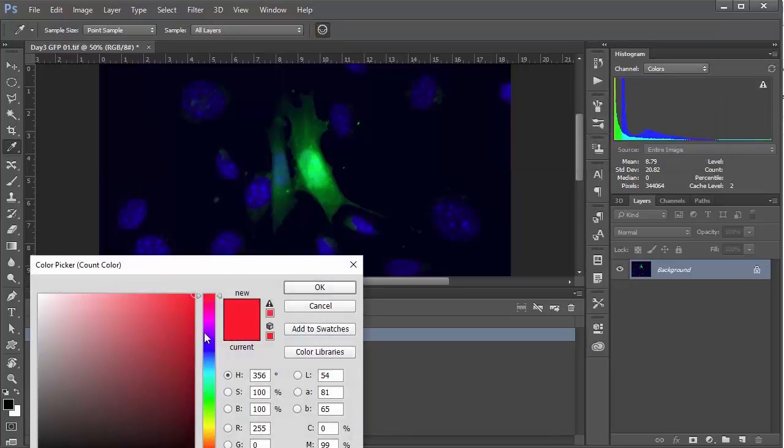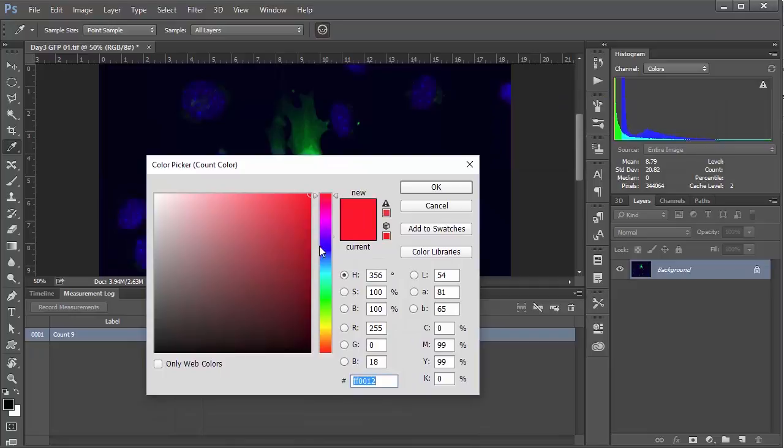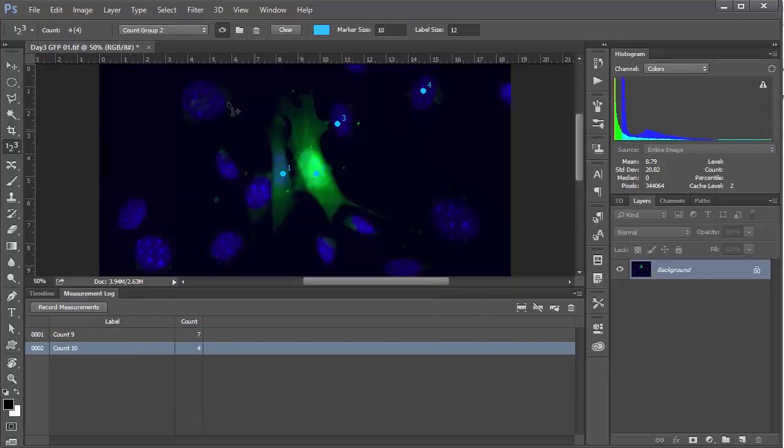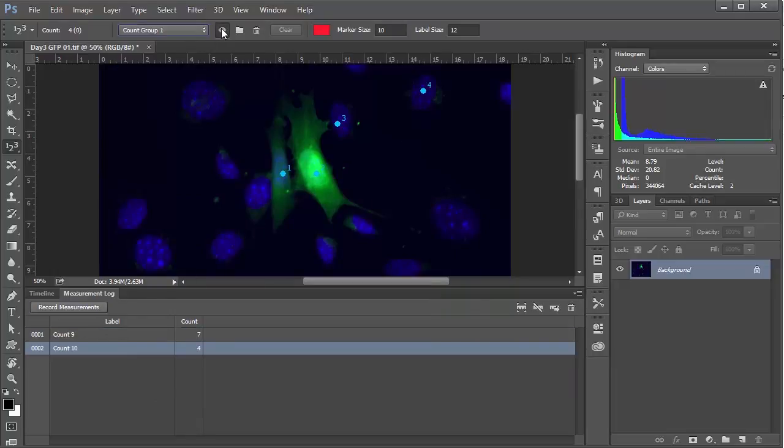We can go ahead and change the marker color just for a little variety and count maybe a few other cells. And again we can go ahead and hit record measurements.